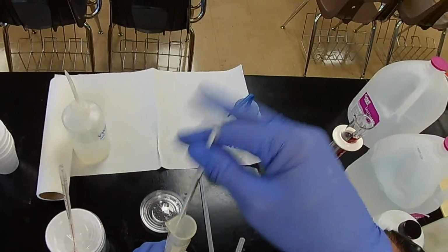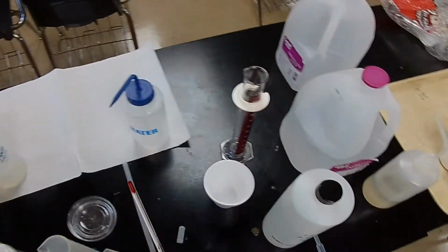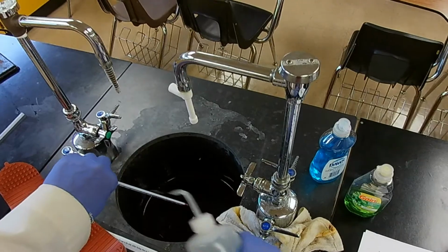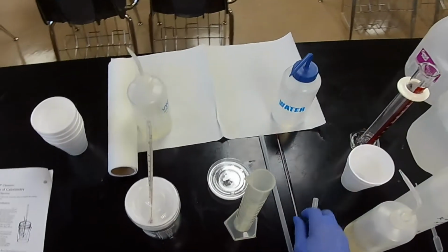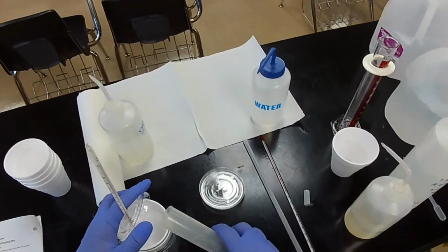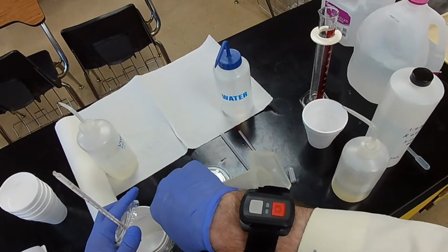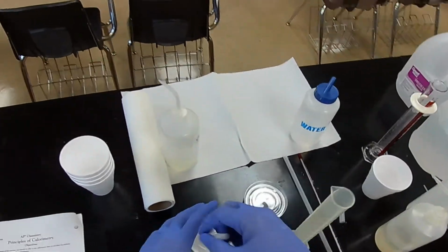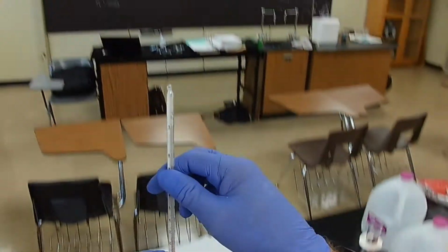We don't want to take any of that potassium hydroxide with us because we just measured it out. Let's clean this off. There we go. Now we're ready to add them together. Close up our calorimeter and start measuring, watching the temperature change.